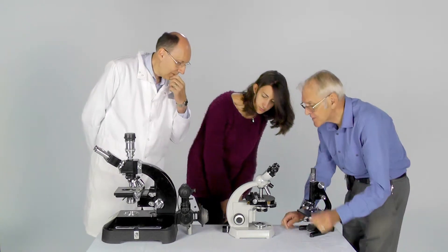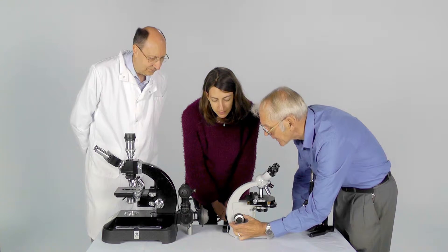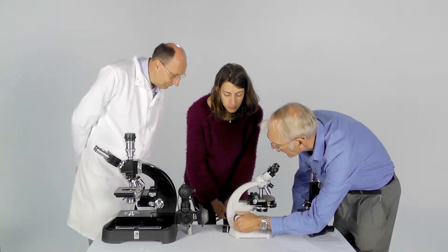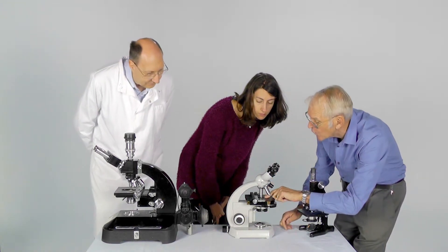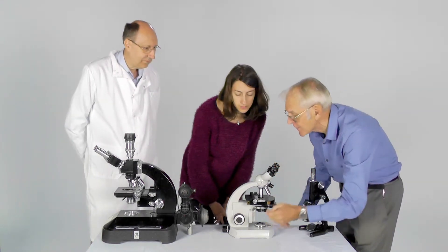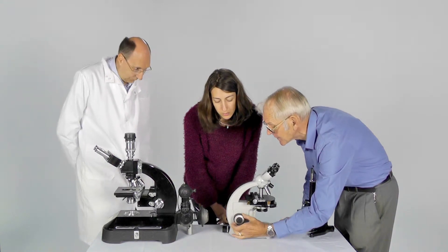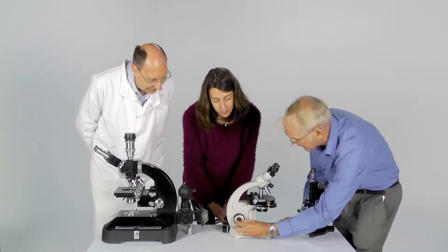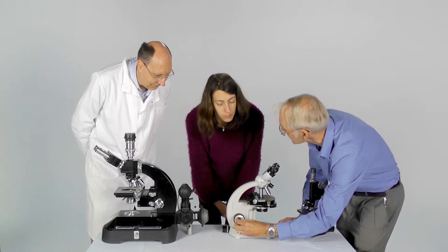What about these knobs here? These knobs are very important because they are used to move the stage up and down in order to bring what's on the stage into focus when we're looking through the eyepieces. There are two knobs. The larger one is for the coarse adjustment, and the lower one is for the fine adjustment.